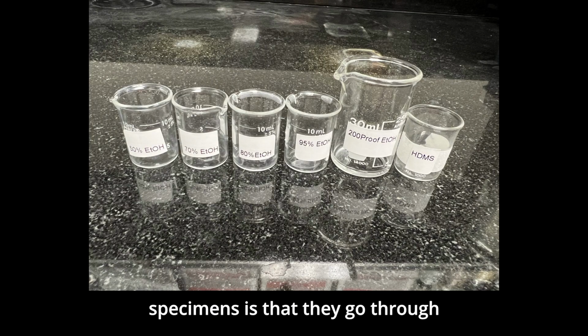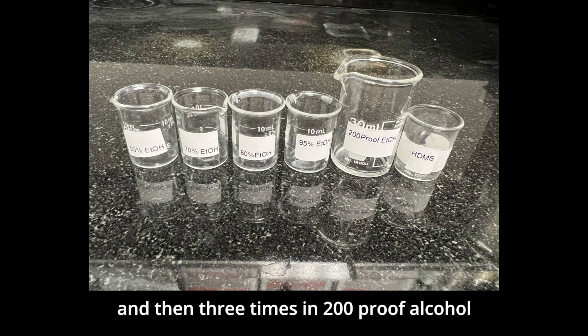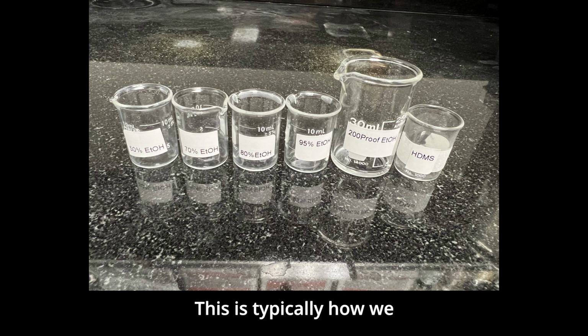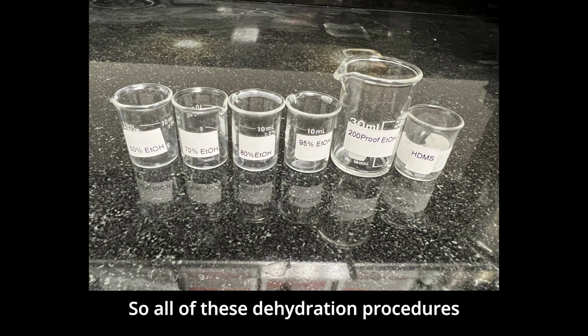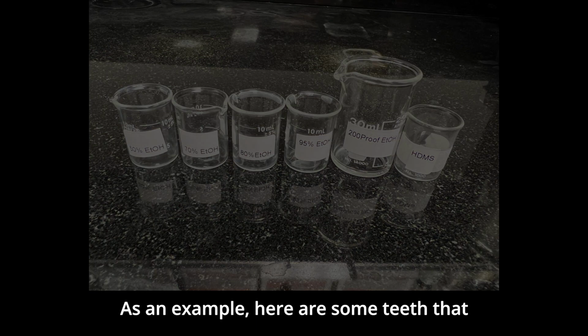The way we dehydrate specimens is that they go through a series of increasing alcohol concentrations, starting with 50%, then 70%, then 80%, then 95%, and then 3 times in 200 proof alcohol, and then in HMDS as a substitute for critical point drying. This is typically how we dehydrate our specimens at PERF. So all of these dehydration procedures affect the image dramatically.